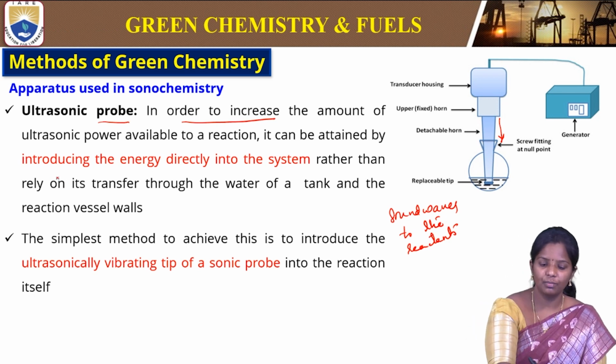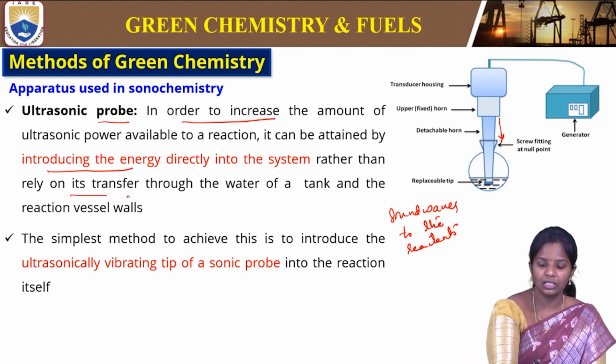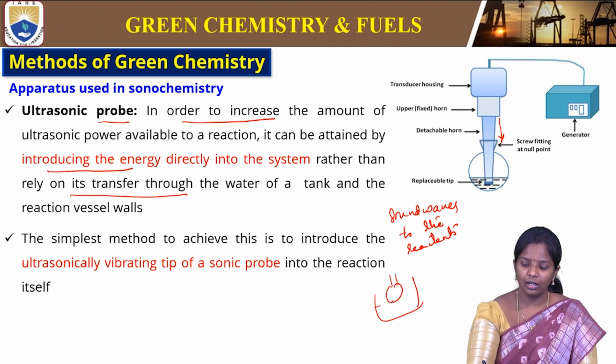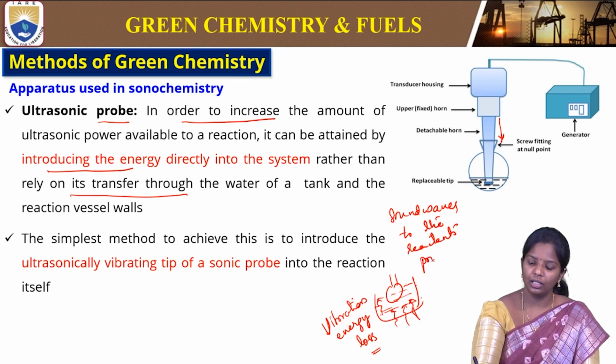This can be attained by introducing the energy directly into the system, rather than relying on its transfer through the water of a tank and a reaction vessel. If we are immersing into an ultrasonic bath, there is a chance of vibration or energy loss in this method, but in the probe there is no energy loss.